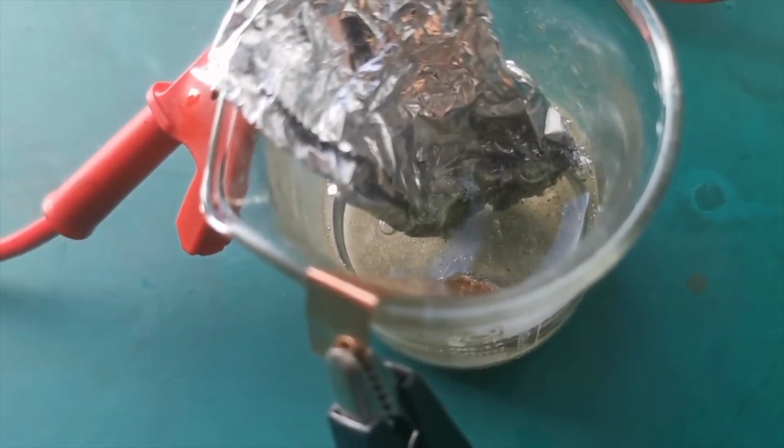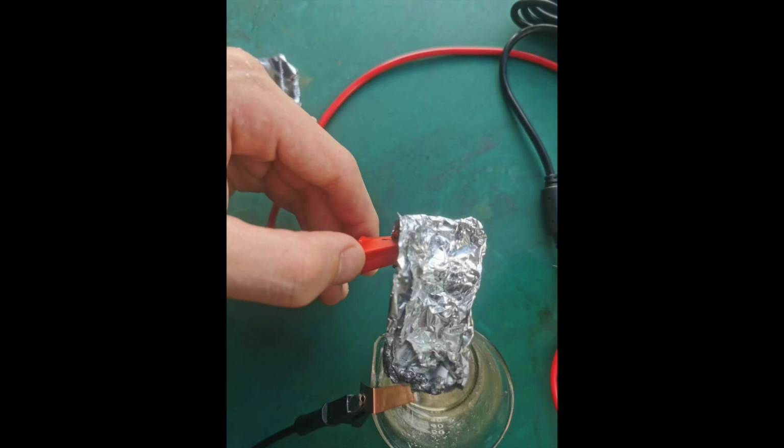Around 9 hours into the electrolysis, the aluminum anode is visibly corroded, which is a very good sign that something is happening. You can see that the part of the foil close to the cathode is eaten away, and the edge of the foil turned black due to exposed aluminum particles. From this point on, the cell is pretty much on autopilot.